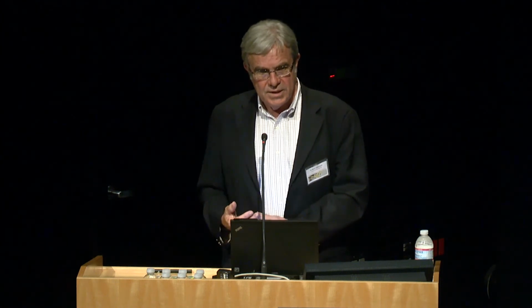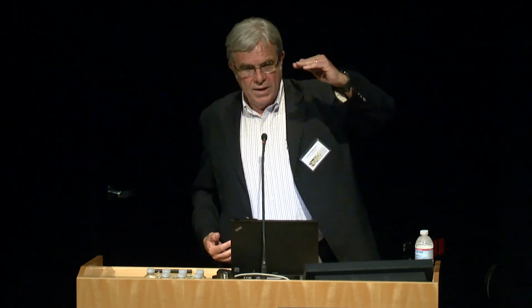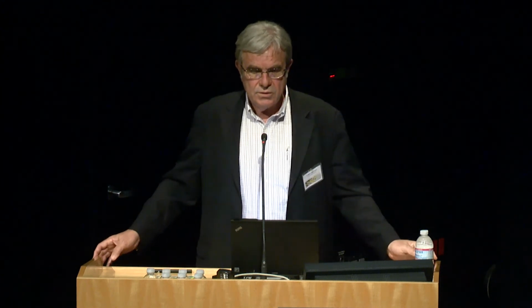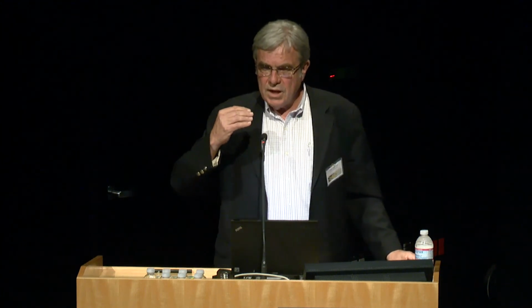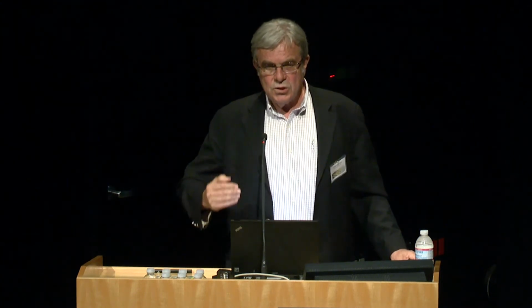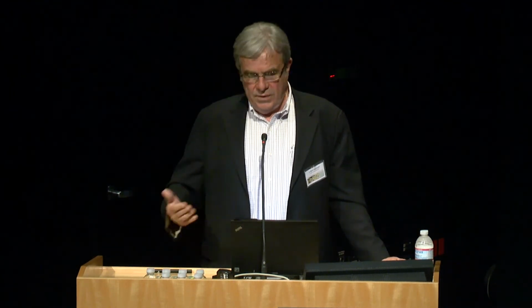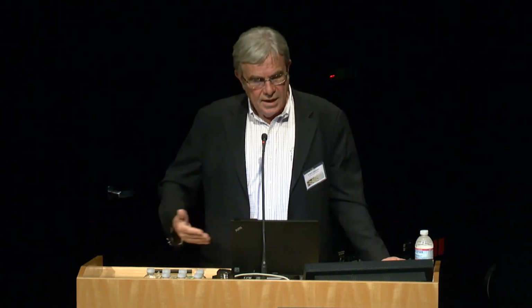That's the electrically stimulated release. There is nothing at all to the cue. Over a period of time, say about two hours, that cue response grows in, and it looks like what I showed you. Now, if you do something like cocaine self-administration, you're talking about 12 days of training where you teach the animal to press a lever to get its own cocaine. Or if you're talking about acquisition of this kind of behavior with food pellets, again, it takes about a week or 10 days to train the animal.